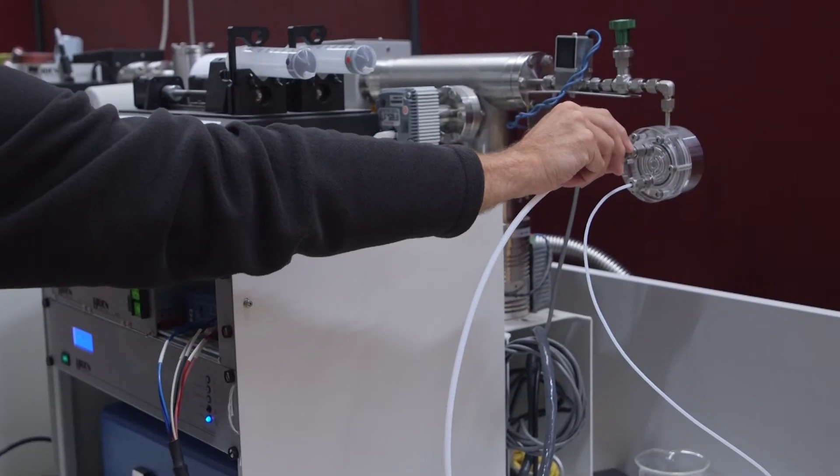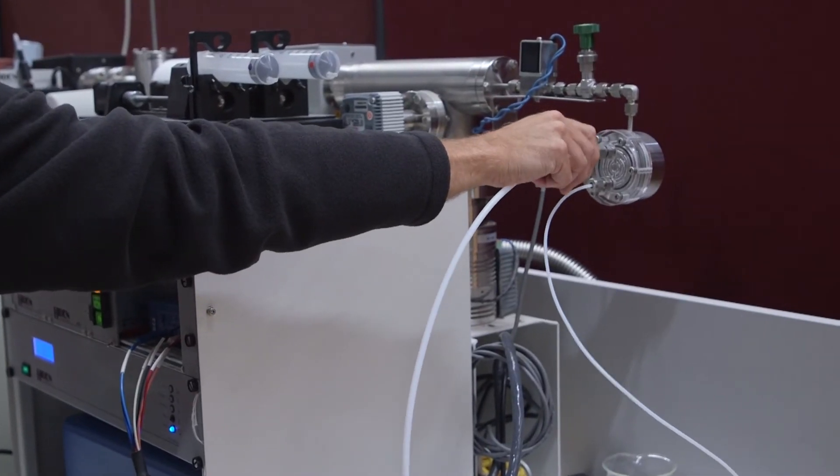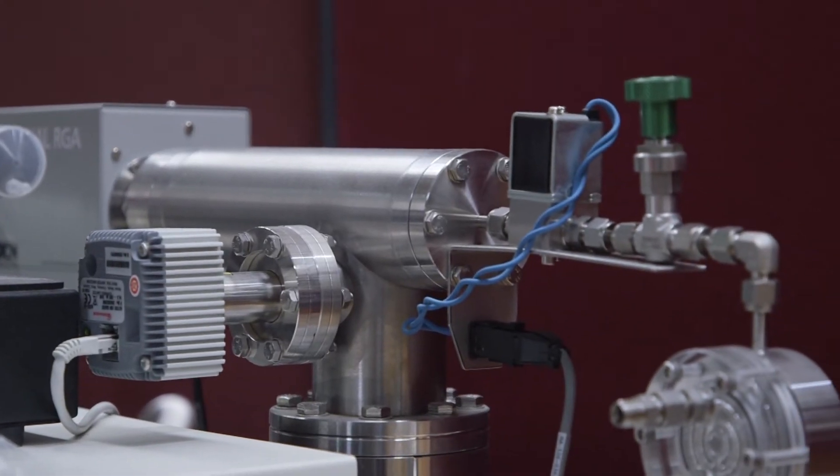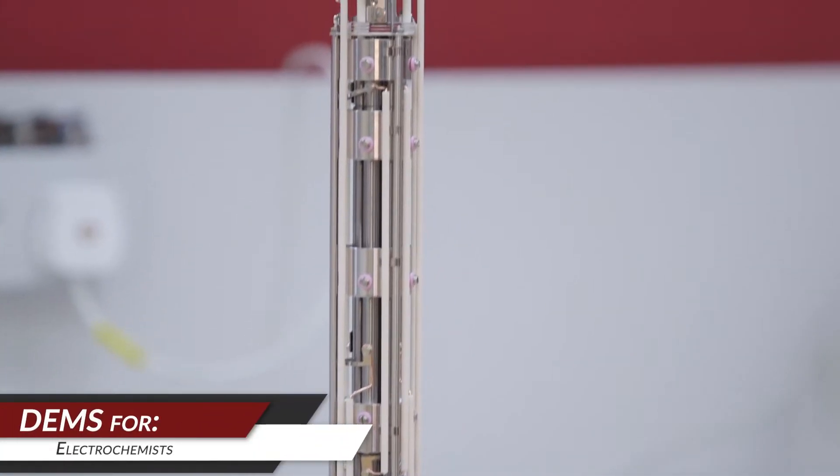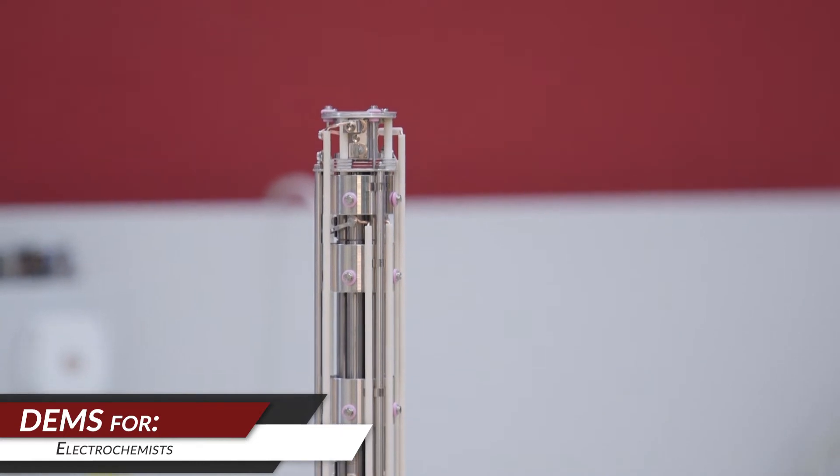Carbon dioxide reduction by electrolysis allows the production of hydrocarbons from captured carbon dioxide. We have our own cell which allows the users to look at the mechanisms of this process and fine-tune it. It allows them to quantify the products in their liquid electrolytes.